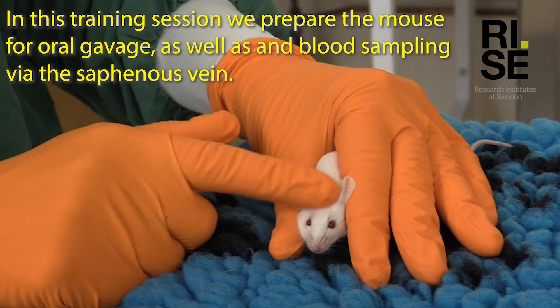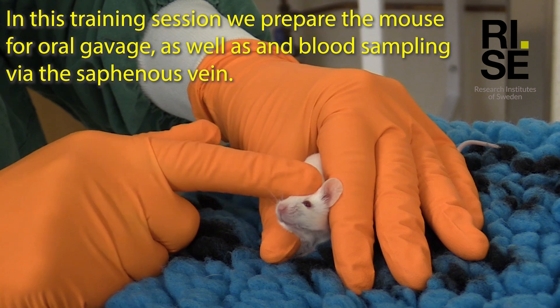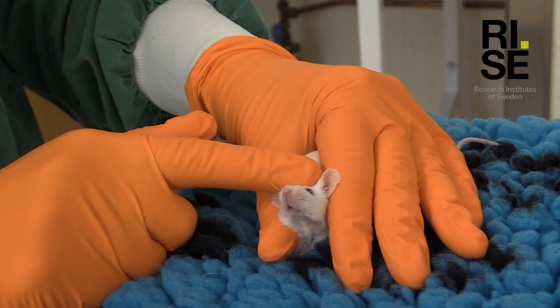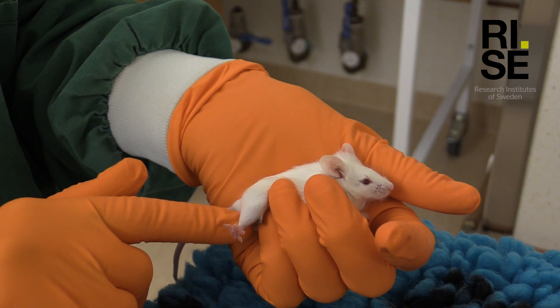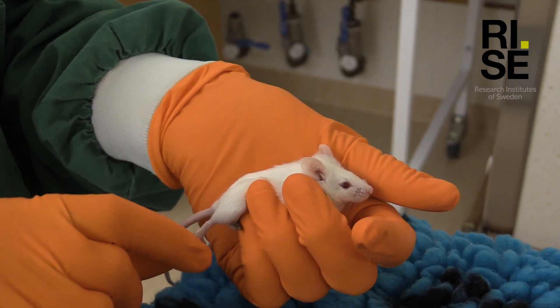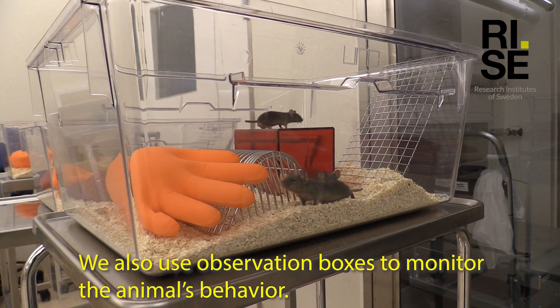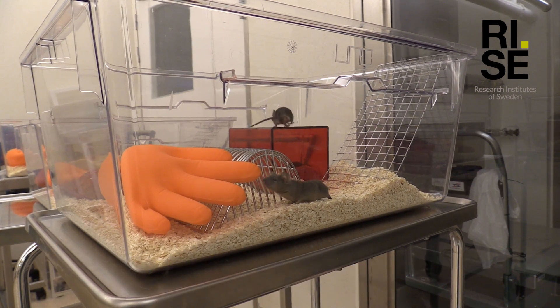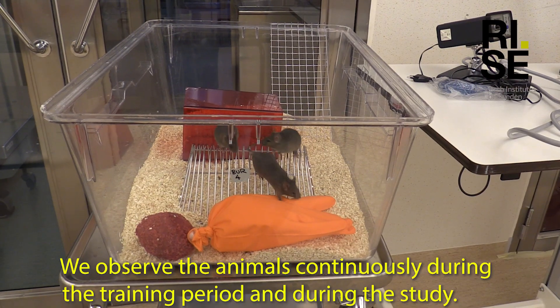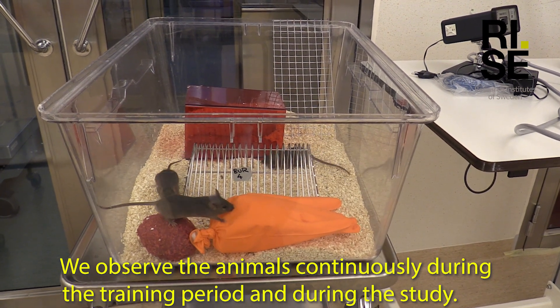In this training session we prepare the mouse for oral gavage, as well as blood sampling via the saphenous vein. We also use observation boxes to monitor the animal's behaviour. We observe the animal continuously both during the training period and during the study.